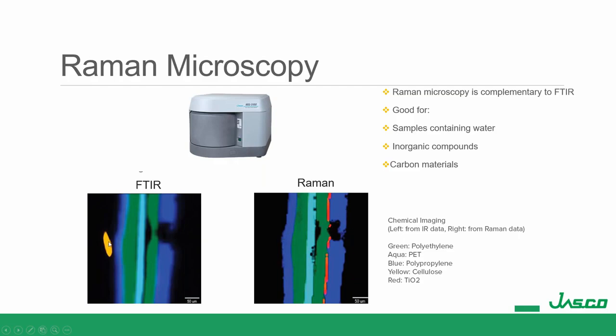However, this impurity doesn't show up on Raman, and it shows up on IR. There are a lot of compounds that don't show up on Raman but do show up on IR, and that's the basis of wanting to have both techniques.